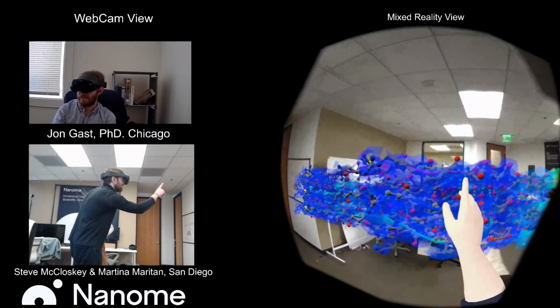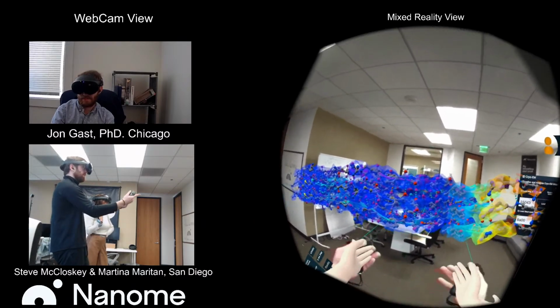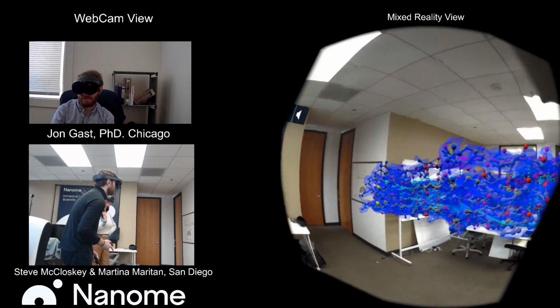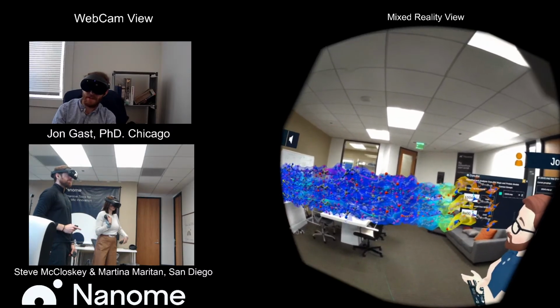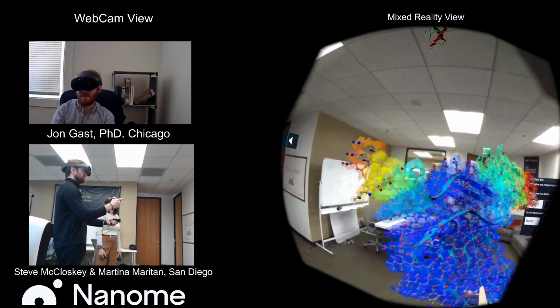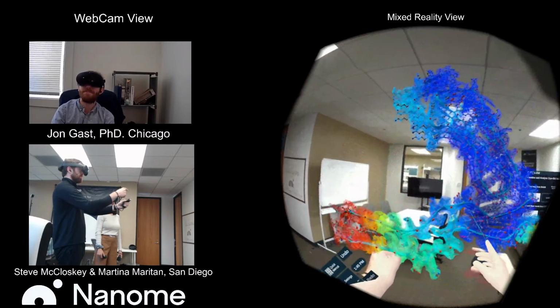Everywhere where there's a blob poking out, I see a nice computational structure with that residue in there. And we know the sequence is accurate because we already know the protein sequence. So it does look like it's mapped really well here. And that's something that isn't determined by Nanome. It's read in through the file from the publicly available database. It's something that we're happy to faithfully represent, but don't determine ourselves.